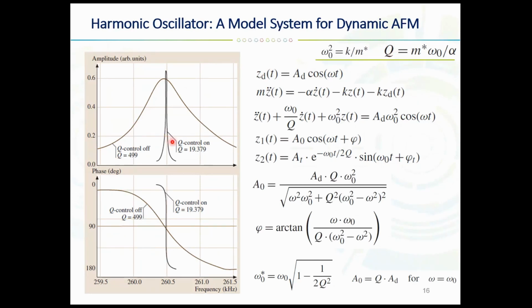So for example, how you can see this in the practical experiment, there is a different amplitude here for different Q factor values, and different phase as well. Again, this quality factor describes the number of oscillation cycles after which the damped oscillation amplitude decays.